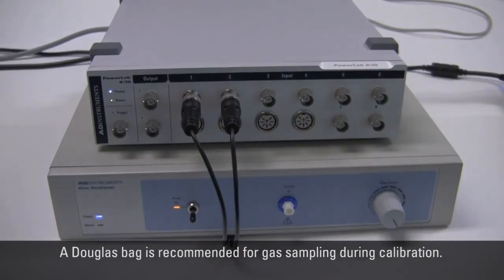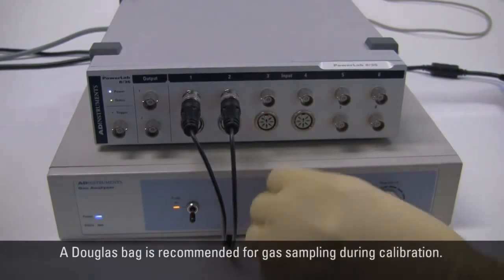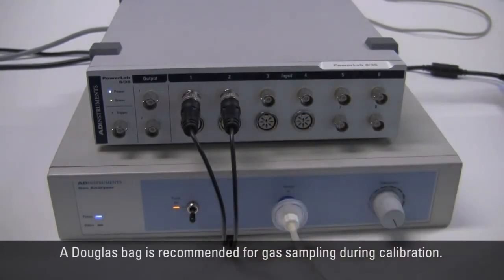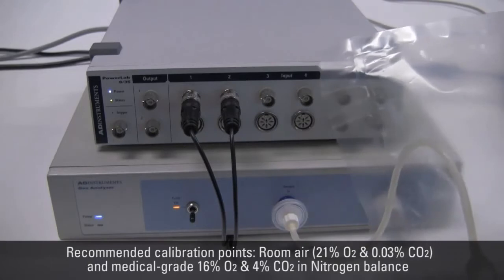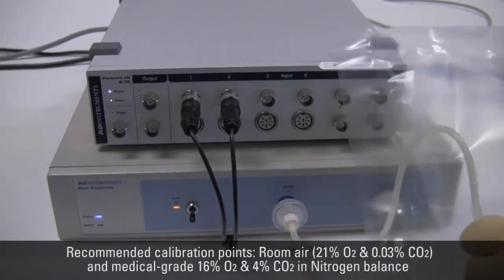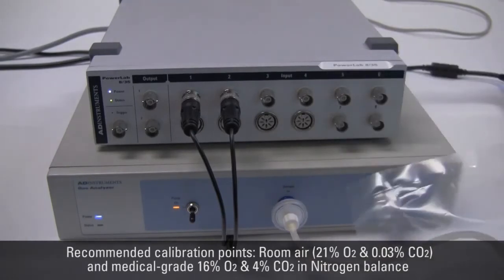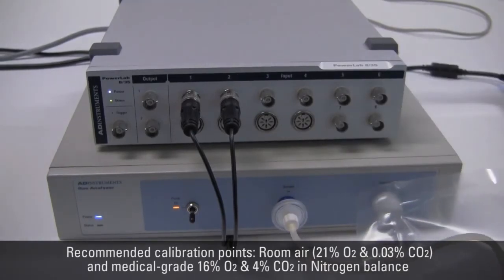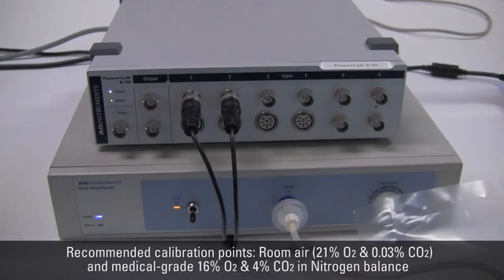The carbon dioxide and oxygen transducers can be calibrated using two gas samples with known O2 and CO2 concentrations. The first can be room air, which has O2 content of 21% and CO2 of 0.03%. The second gas should have O2 content between 5 to 21% and CO2 greater than 2%.